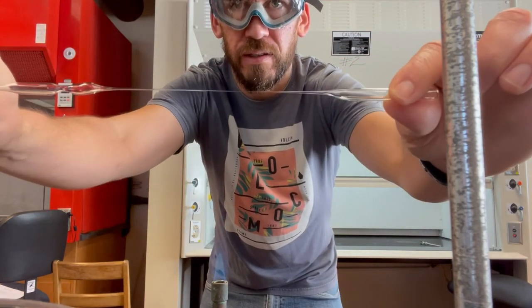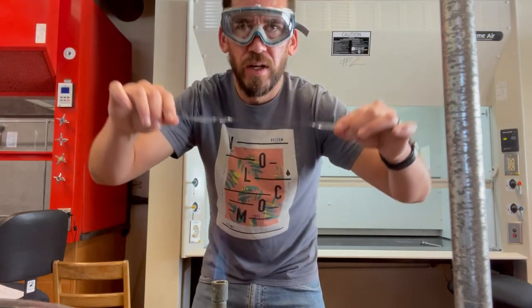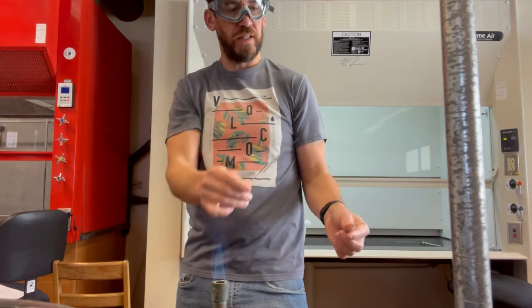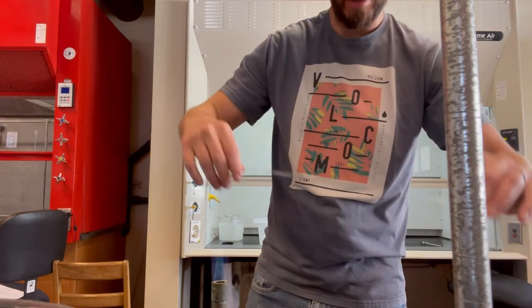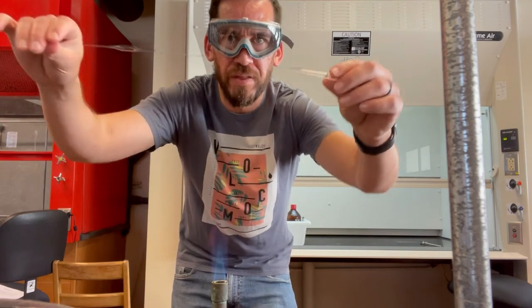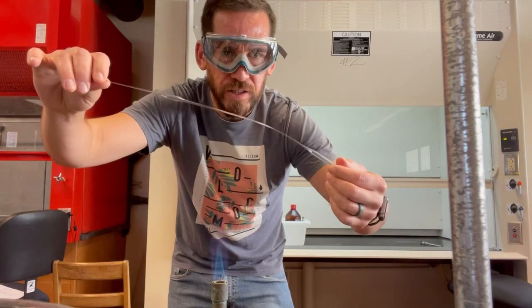And you can see a really thin area, right? That thin area is really what we can use for our capillary tube. Let's see if it breaks in a good area. Because I made another one a second ago, but it's too thick. You can actually see how thick that is. It was a bad camera angle, so I didn't show you guys.